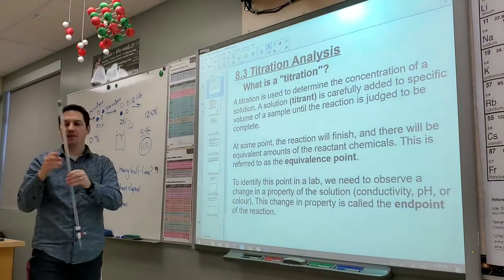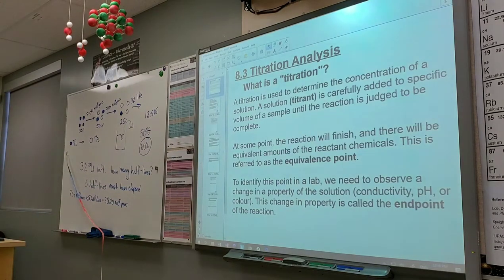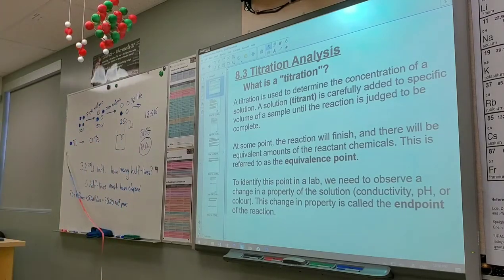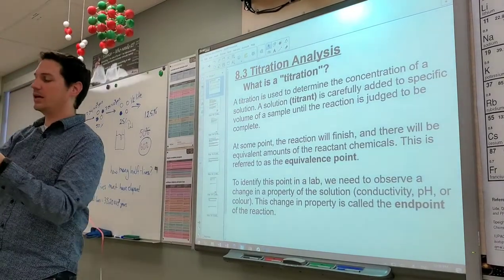This piece of glassware is basically the most expensive piece of glassware that we allow students to use. It's actually two pieces of glassware that are connected at the bottom. The top part is called a burette, and the bottom part you can call a valve if you want, or the proper, historical name is a stopcock, okay?